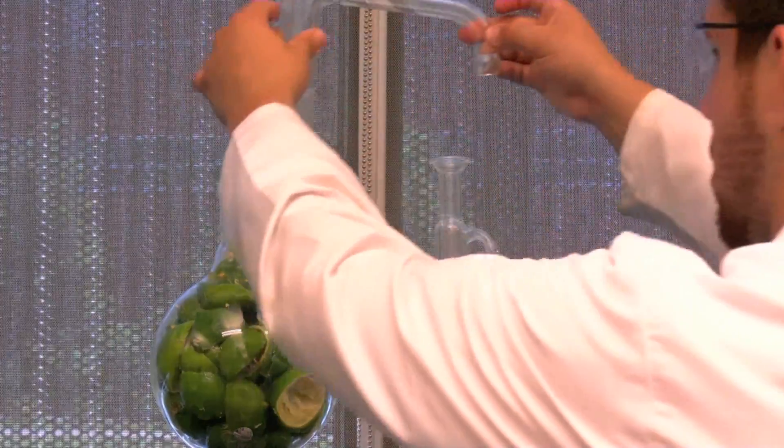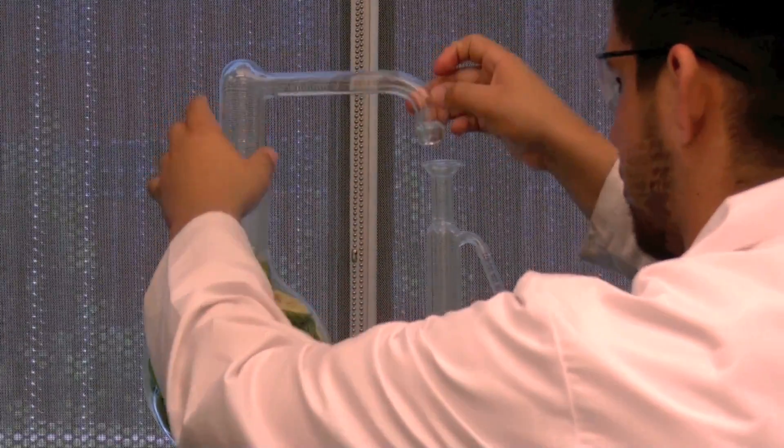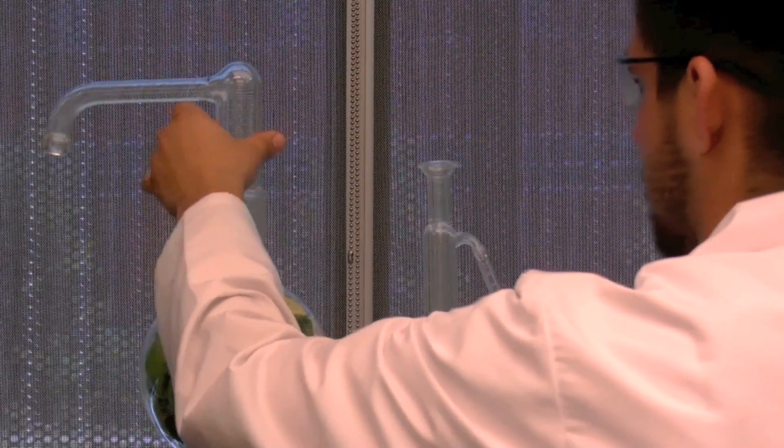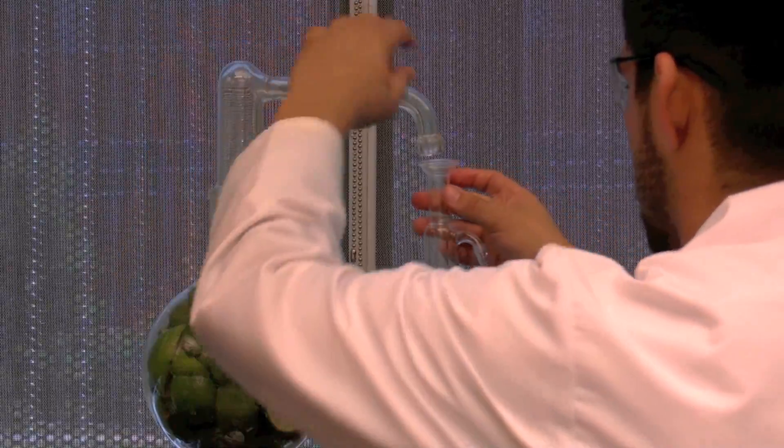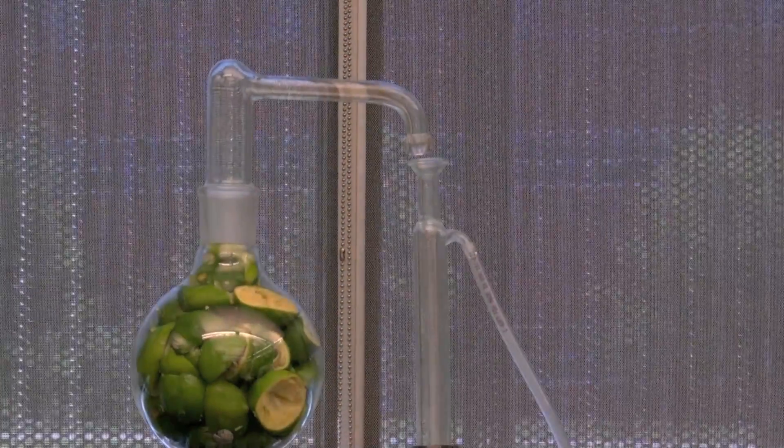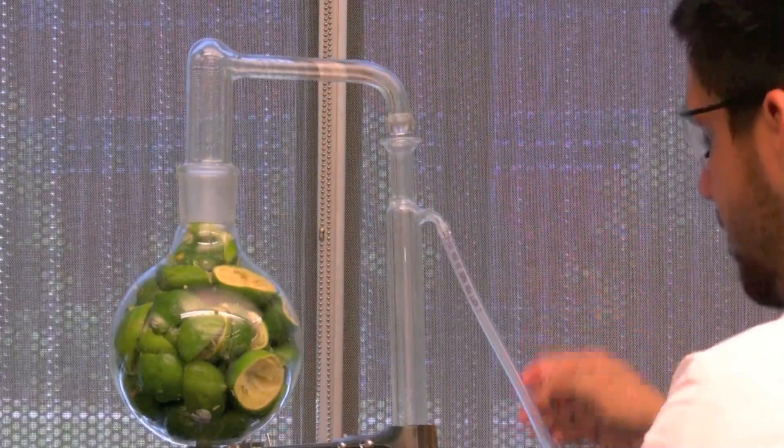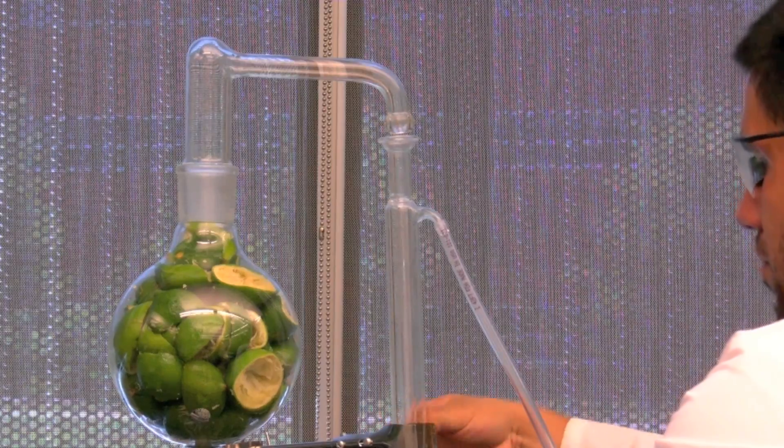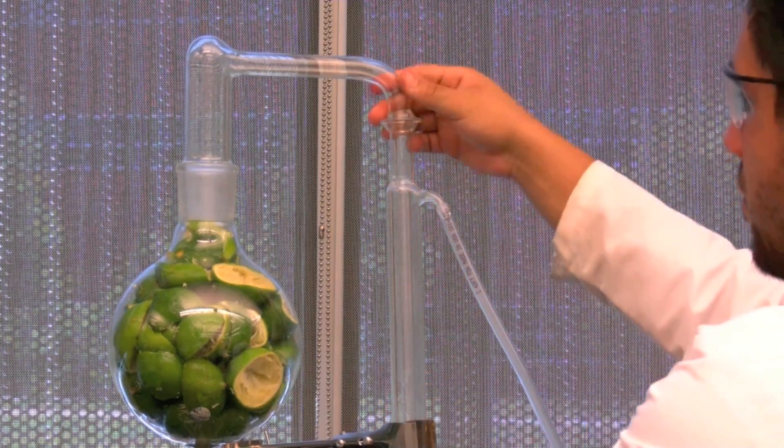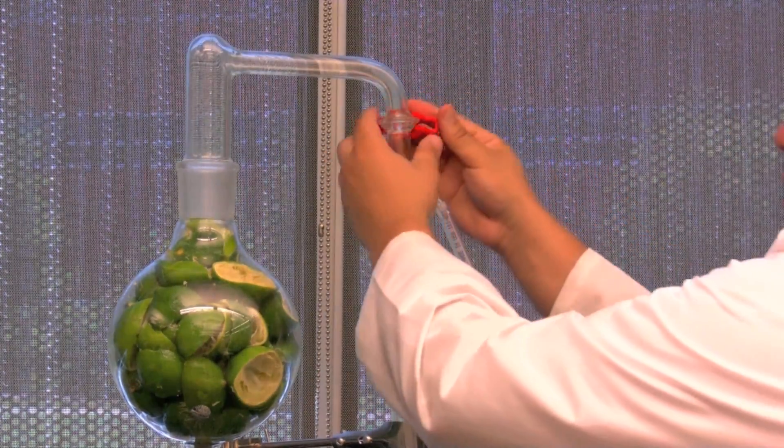Coat both ground glass joints of the still head with a thin layer of silicone lubricant. Simultaneously connect the still head to the top of the biomass flask and condenser. If the height orientation of the condenser needs adjustment, set the still head on the counter before making adjustments. Secure the still head to the condenser using the red plastic connection clamp.